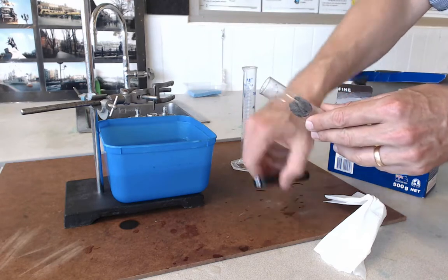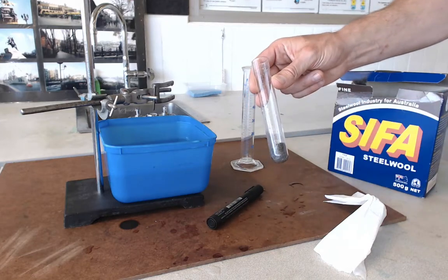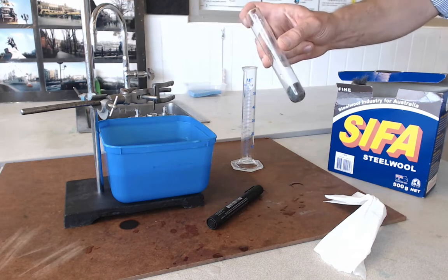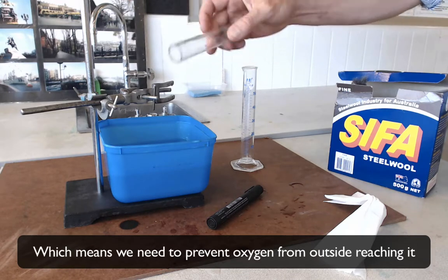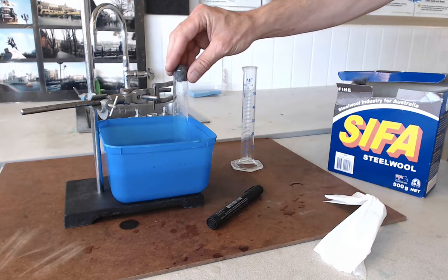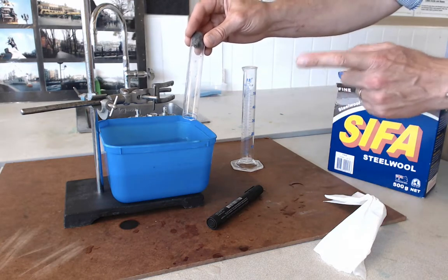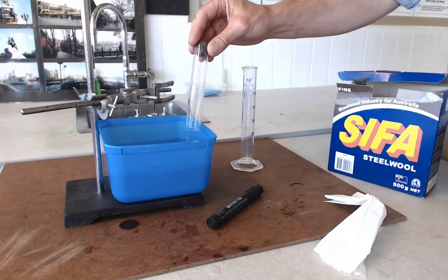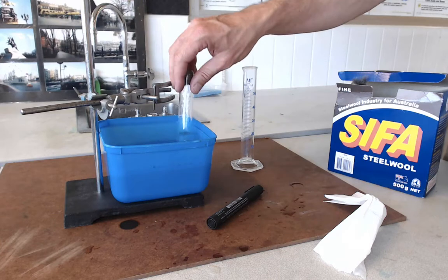We're going to shove the wet iron wool to the bottom of our boiling tube. Now I want to seal this tube so that only the oxygen in the tube can react with the iron. The way I'm going to do that is by submerging the mouth of the tube in this water. But I've also got to mark the level of the water inside the tube, and this is much easier if the water level inside the tube is a bit higher than the level in the tub, so I'm just going to put a little bit of water into it first.